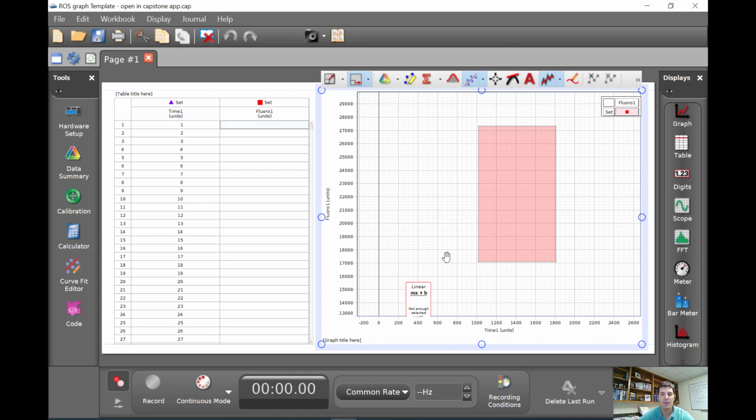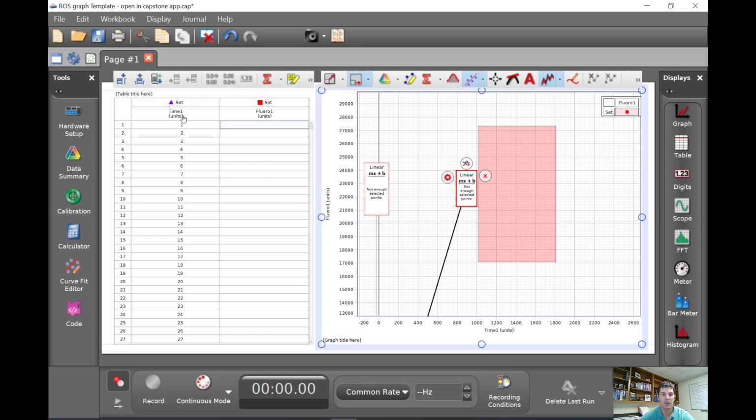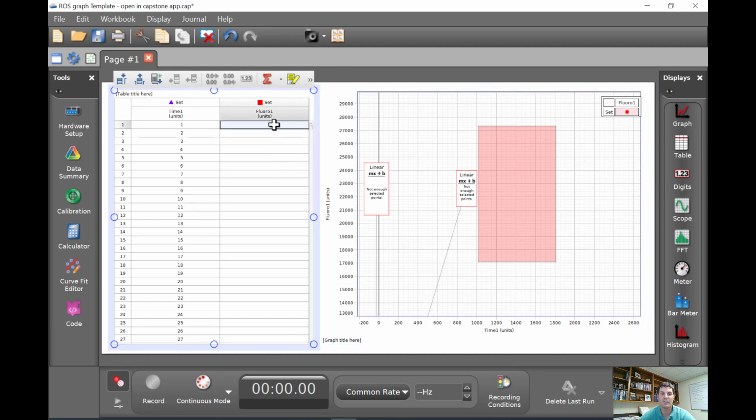To kind of work you through, what we're going to see here is a couple things. So on the left side of the table here, this is our x-axis. So in our measurement of ROS, we're going to look at the x-axis as time, and ultimately we're not really caring literally what time it is, just each consecutive measurement. And so I've set up the x values already here. What we need to get is the y values, and the y values can be found in the text files with the graphs. Again, these are in the folders in which I've given you, typically organized by date.